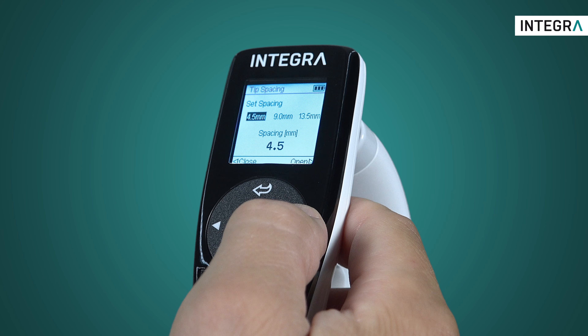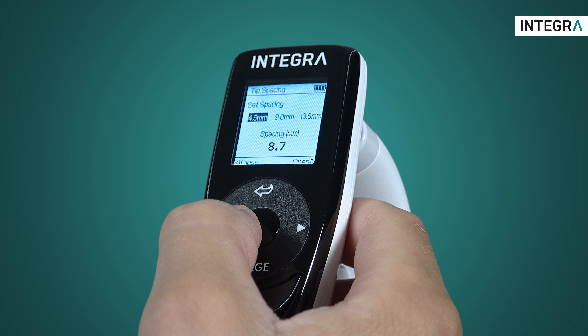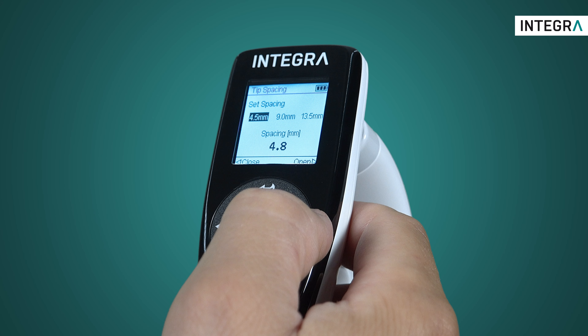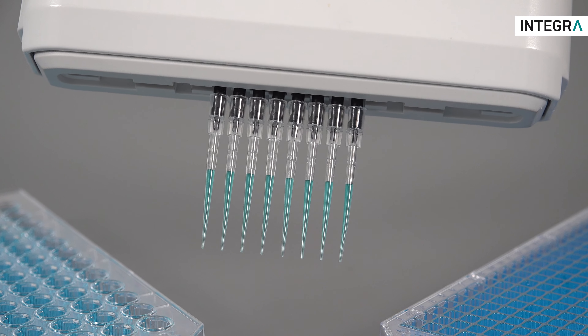Simply select the position and teach the pipette what the spacing should be. This is easily done by simply holding open or close, and the tips will physically move as well, allowing you to visually match the tip spacing to the source and target vessels.